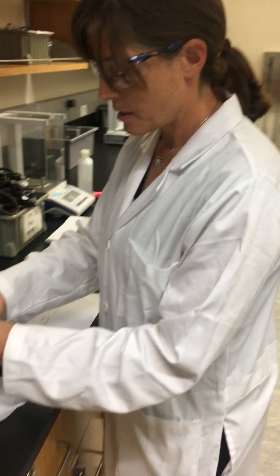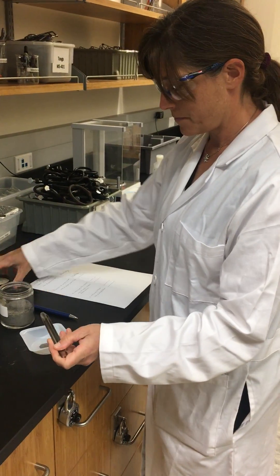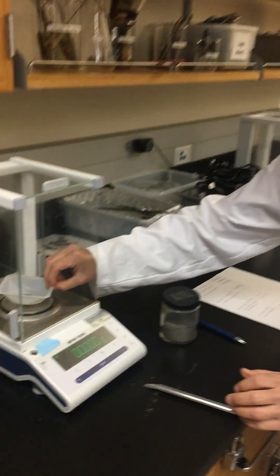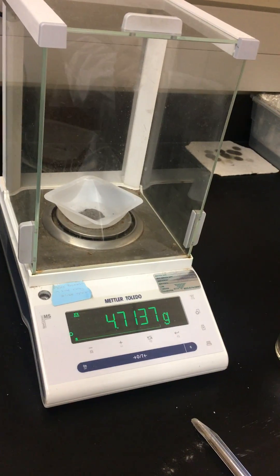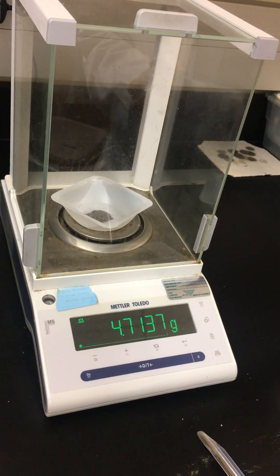So we will take some iron. We'll add it to our balance and we'll record the mass. And then you'll be able to subtract the weigh boat to get the mass of the iron and then use that to do your calculation.